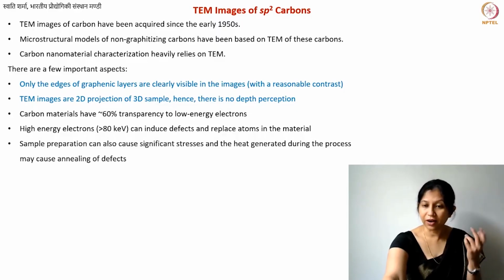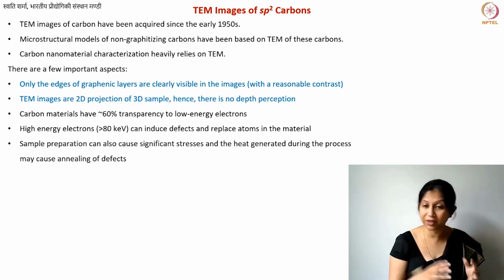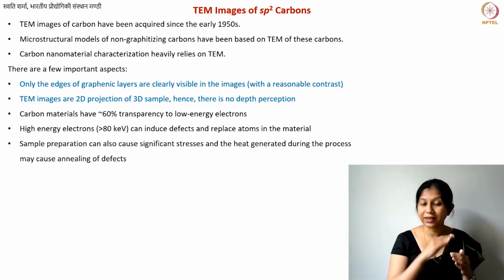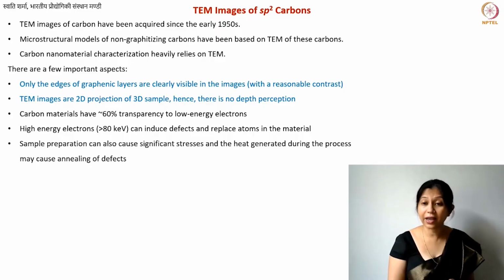Sample preparation itself, I already told you, can create defects. You are often using either focused ion beam milling or some sort of technique for making powders. In that case, you're definitely using very high energy to make these slices or powders, and there you may also have higher temperatures occasionally, depending upon how you're making your sample. But our materials are temperature sensitive. You know that.